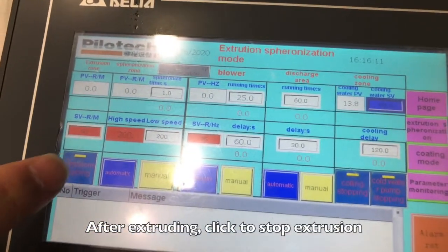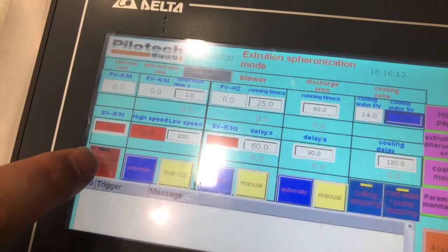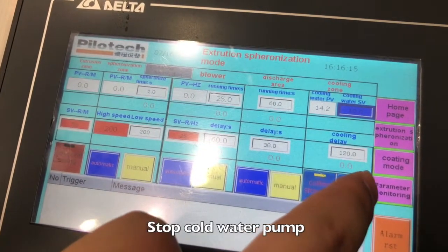After extruding, click to stop extrusion. Stop cold water pump.